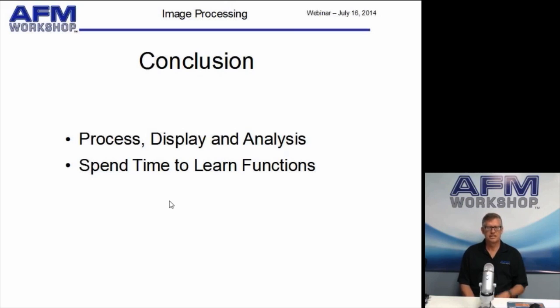The conclusion is that you can process images, which is associated with changing the numbers in the matrix. You can display images, which has to do with how the matrix is viewed. You can do analysis. It'll take you about an hour or two to learn how to use Gwyddion software at a basic level, which I've presented here.